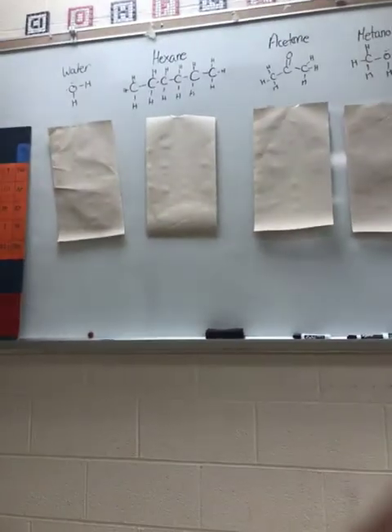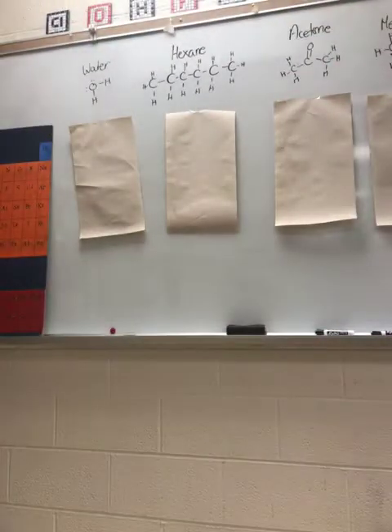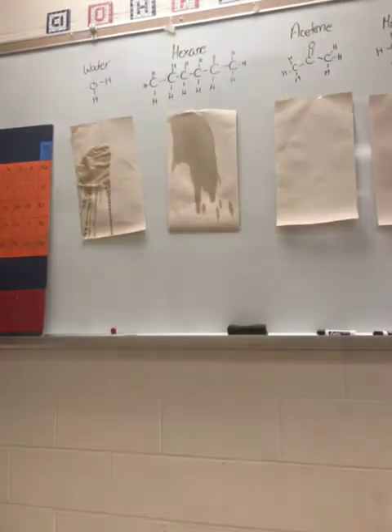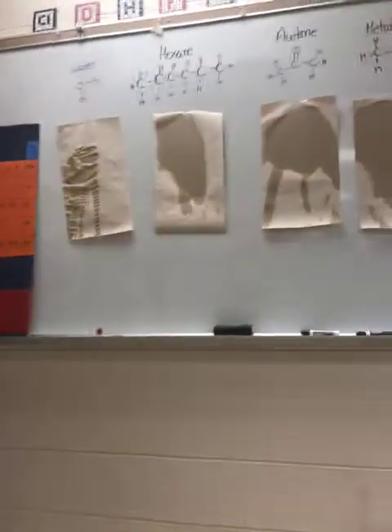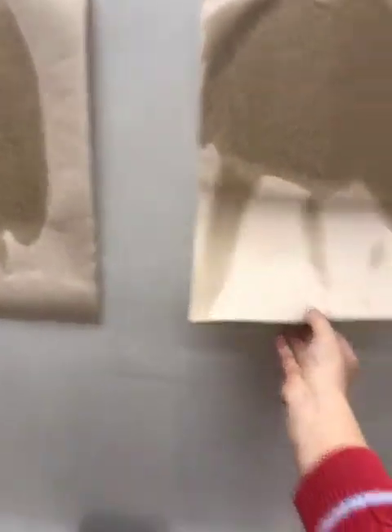So hopefully you've tried to figure it out. I'm going to go ahead and pour the beakers over these paper towels as fast as I can. So do water and hexane first, and then the other two. And we're going to observe and see which of them will evaporate first. So I'm going to give them a little bit of a helping hand here, and I'll do each of them equally.